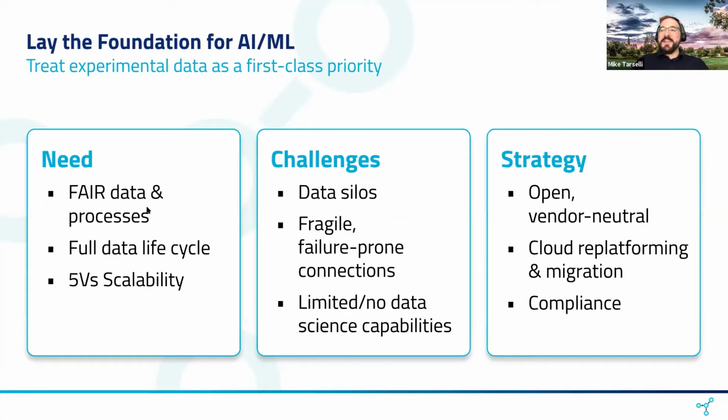I know we talked a little bit about needs, but let's also pivot into the challenges of having an on-prem and fragile data ecosystem. First, silos inevitably build up, right? Your biological data sets for your imaging on this particular program might only be in one specific DB, only accessible by a handful of your researchers. What if data scientists in preclinical want to see that? What if manufacturing could learn lessons from the cell culturing you did and want to scale them up for bioprocessing, but they can't get at your data? What is the impact of data having to be regenerated, for example?